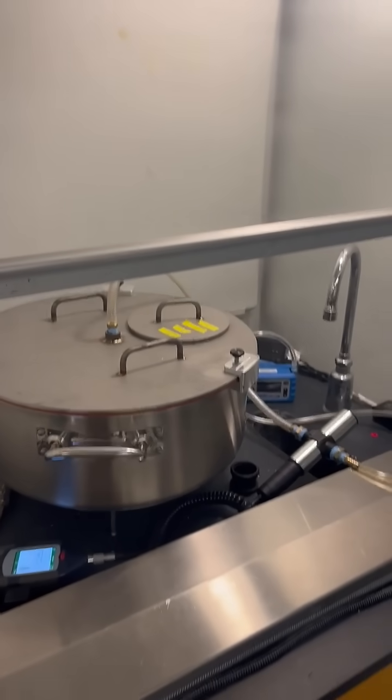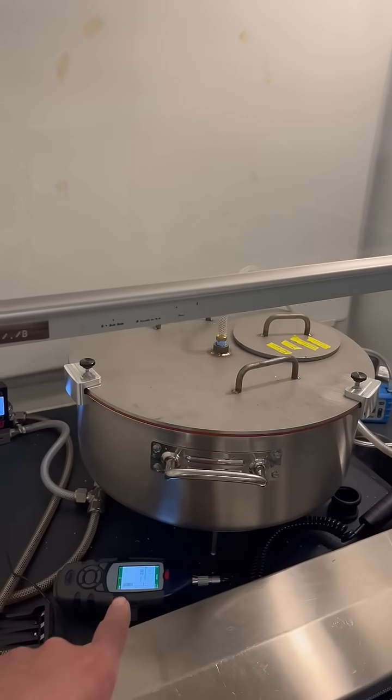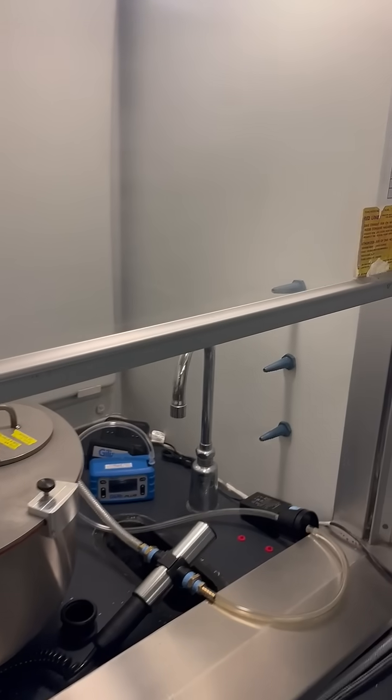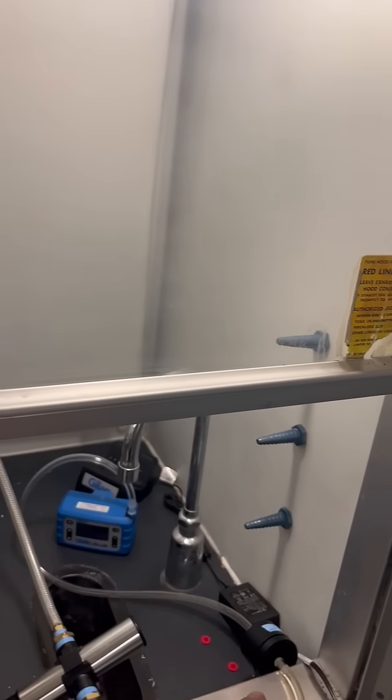We're actually measuring to make sure that we're hitting our target with a real-time air monitor called a micro dust pro, as well as using a gravimetric analysis using this pump and filter cassette.